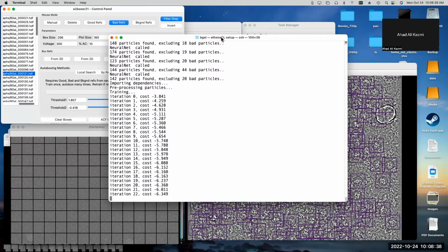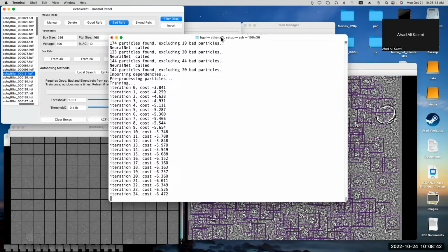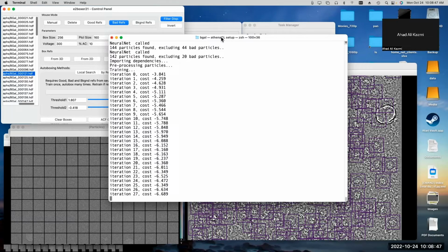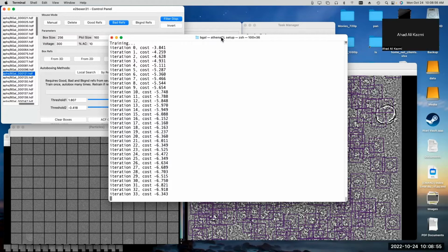Okay. While selecting particles, is it possible to adjust the value for the low pass filter? Just to, I don't know, identify particles easier in the beginning before setting this neural network up. What low pass filter are you talking about? I was wondering whether it's possible to implement a low pass filter when looking for particles in general before training your network.